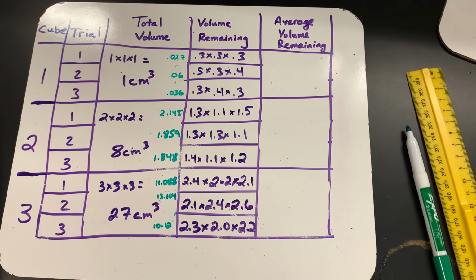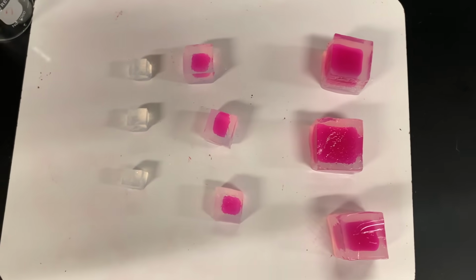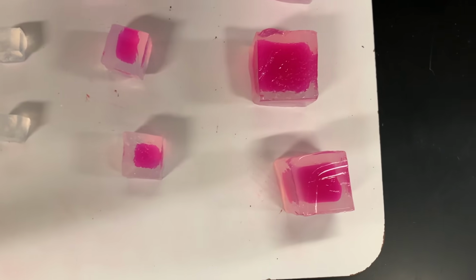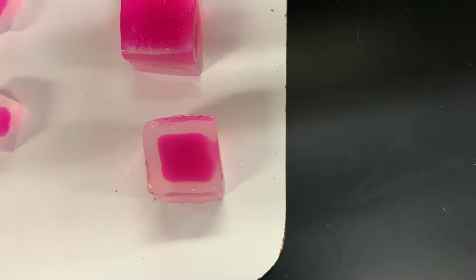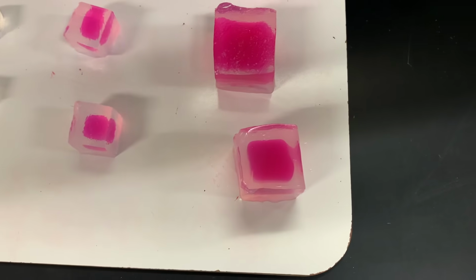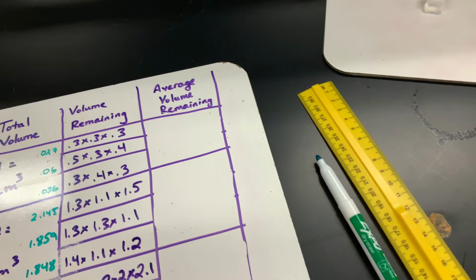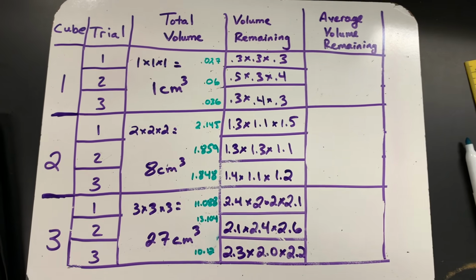Finished filling out our data table here, but I also wanted to show you this. Like I said, there's still hydrochloric acid on and penetrating the cubes, so they get smaller. So you kind of got to do this quickly. Look at the ones. All that phenolphthalein is actually gone from the inside. So you guys can see that if you do it quickly, you'll get good results. If you lollygag and don't get your measurements quickly, some of your results might actually disappear. Okay? It's a base indicator, so the more acid gets in there, the less indicator you're going to be able to see as that base becomes neutralized.